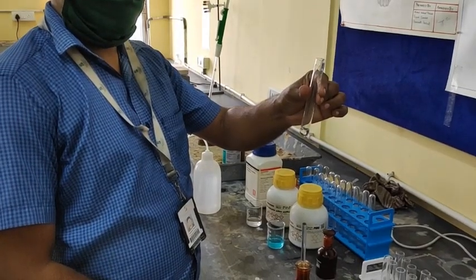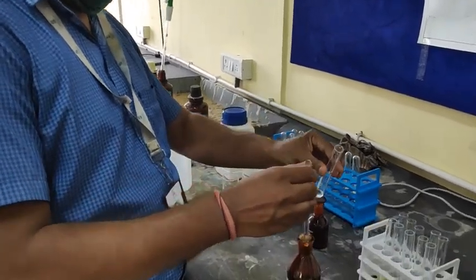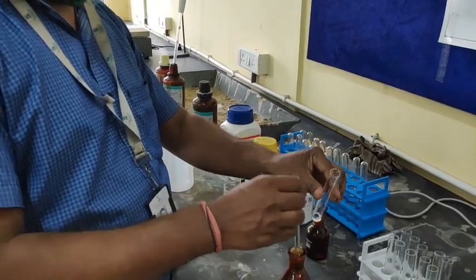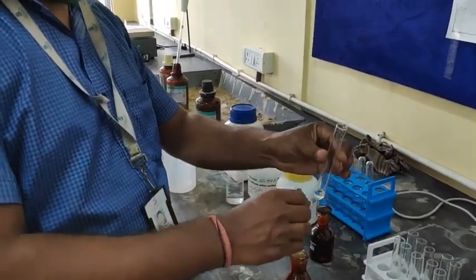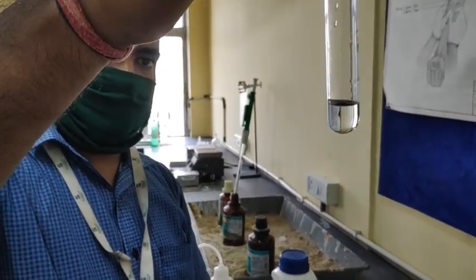Now we will check this one with the blank. As a blank we have taken water, and let's see what happens if we repeat the same experiment with water. Now he has added a few drops of sulfosalicylic acid in water. I think that will be enough, and as we know, there are no such changes.